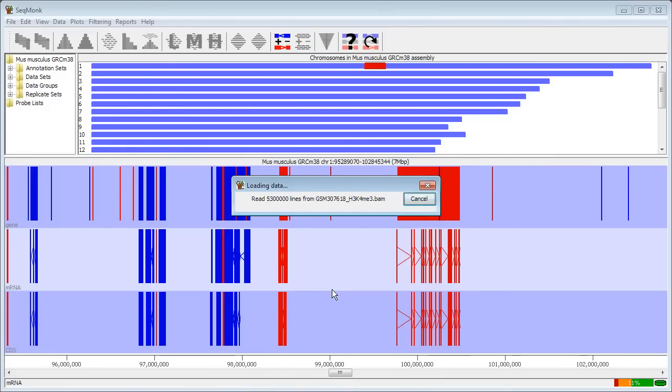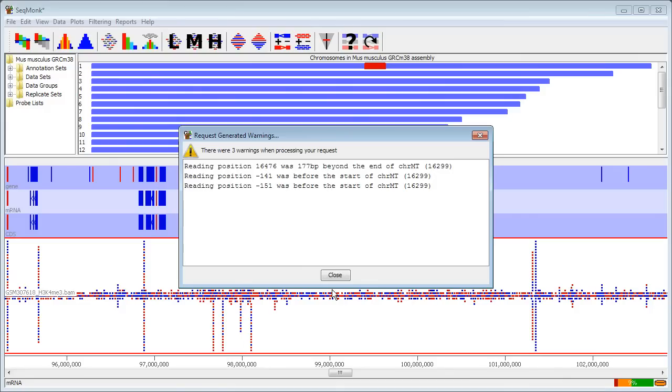The reason I'm extending the data is because what we're interested in in a ChIP dataset is the position of each enriched fragment, but we don't sequence the whole fragment, we simply sequence a short tag from the end of the fragment. If you do paired end data, then you can infer the position of the full fragment by looking at the two ends, but in single end data you can simply extend the read that you have to infer roughly where the whole fragment sits by knowing what the insert size of your library is.